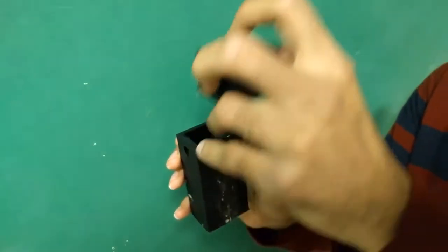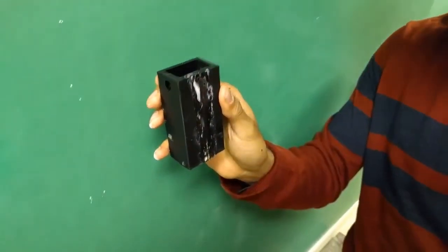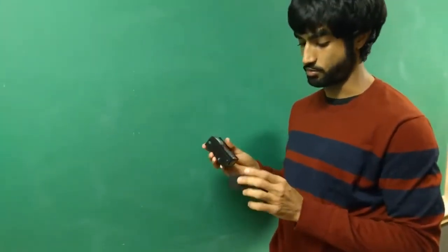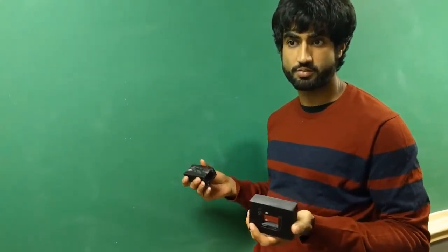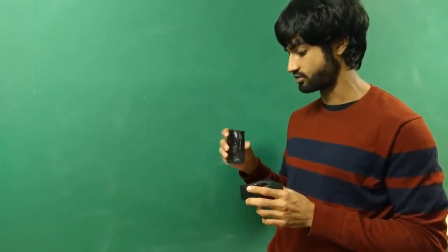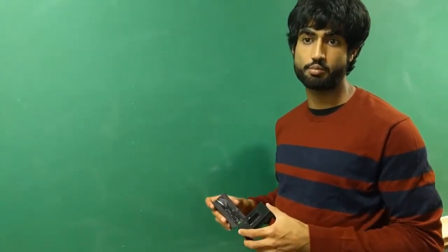The laser goes inside here, the tip first. The laser shines vertically through this column right onto the camera. A major design goal of this apparatus was to make it portable, in that you could easily assemble it, disassemble it. Field ecologists go out in the field and collect samples and take them back to the lab to analyze later. But using something like this, you could analyze right in the field, know if you have good or bad data, good or bad samples, and continue your work instead of finding out the hard way later.